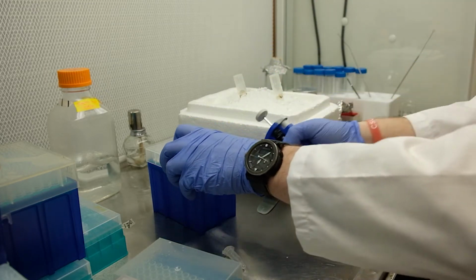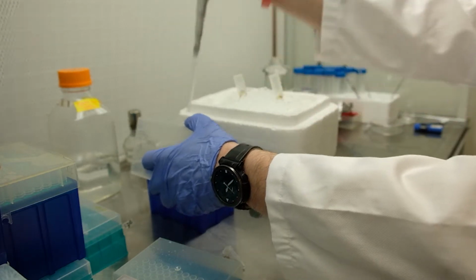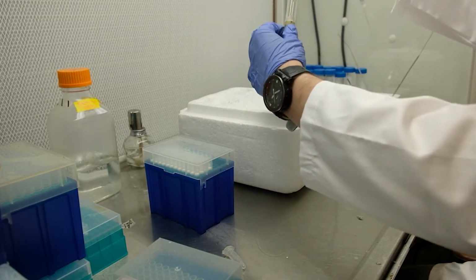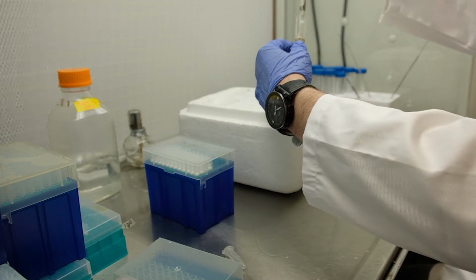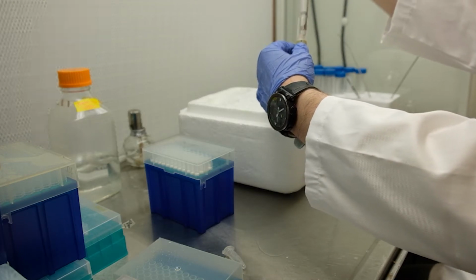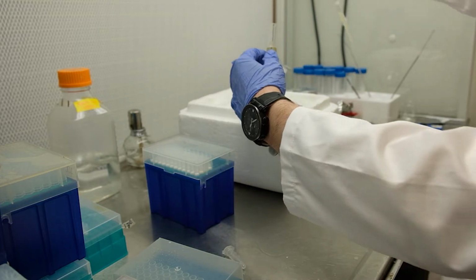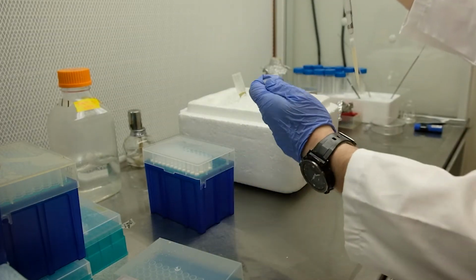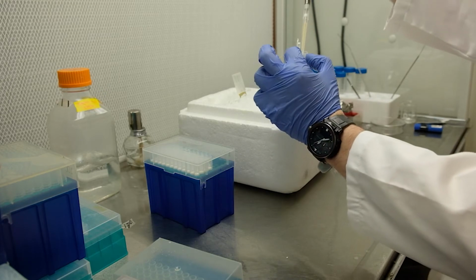There, I finished transferring culture A into microfuge tube A. Now we'll do the same for tube B. Also keep both your main cultures and your microfuge aliquots on ice.